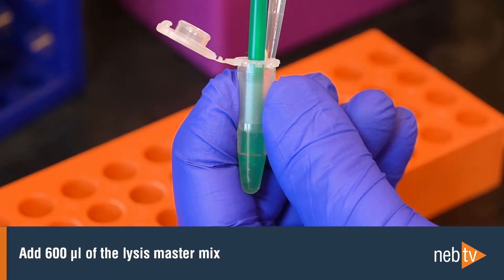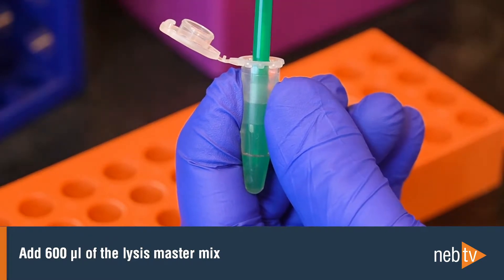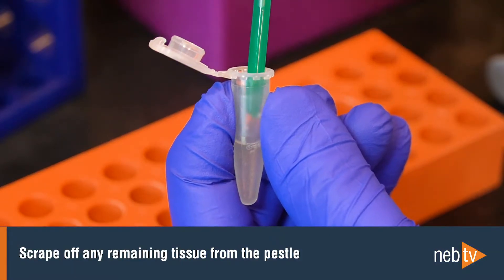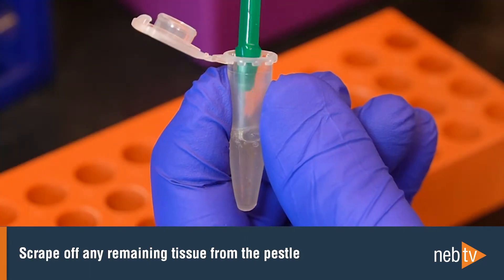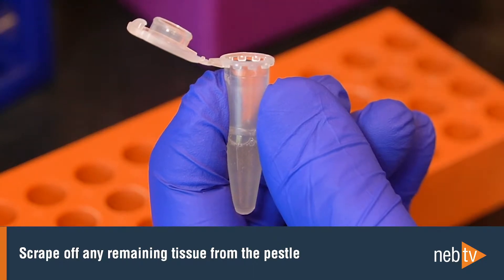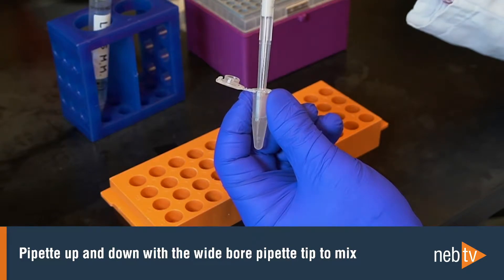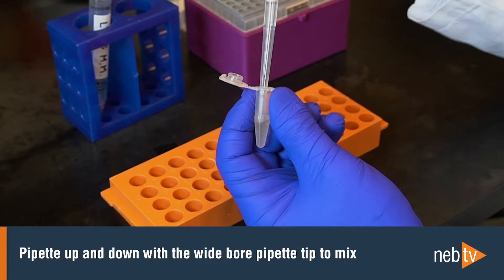Use a wide-bore pipette tip to add 600 microliters of the Lysis MasterMix to the sample. Do not dispose of this tip yet as it will be used to mix the sample later. Make sure there is no tissue material left on the PESL and if there is, transfer it carefully into the tube by wiping the PESL tip along the rim of the tube. Use the wide-bore tip to pipette the lysate up and down a few times. This ensures all the tissue pieces are lysed efficiently, which is essential for obtaining the highest DNA integrity.